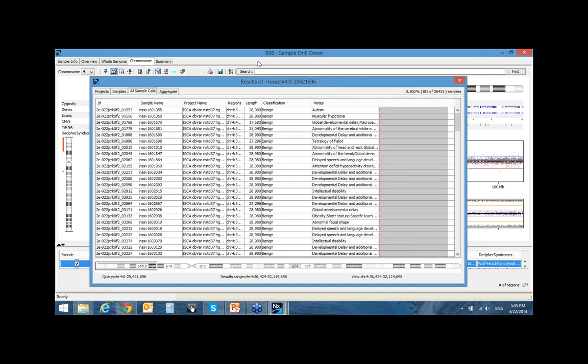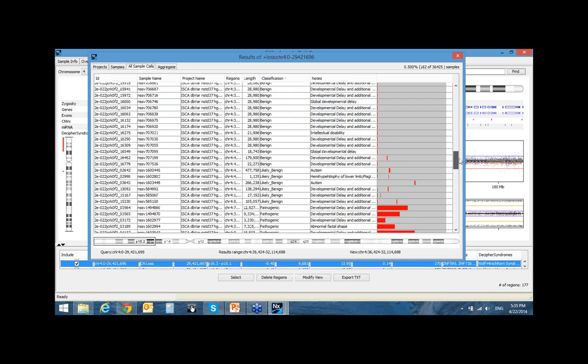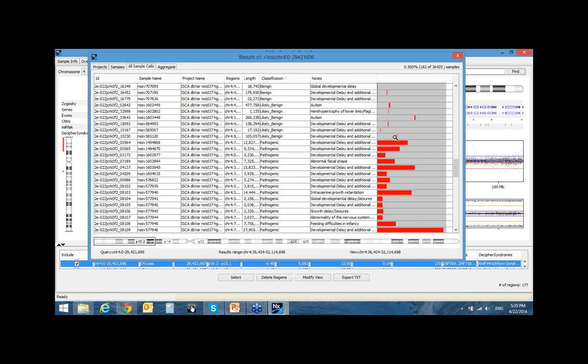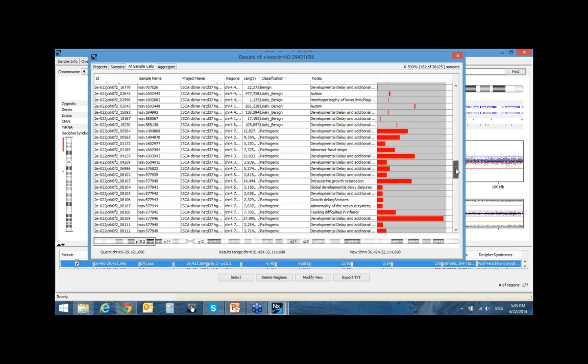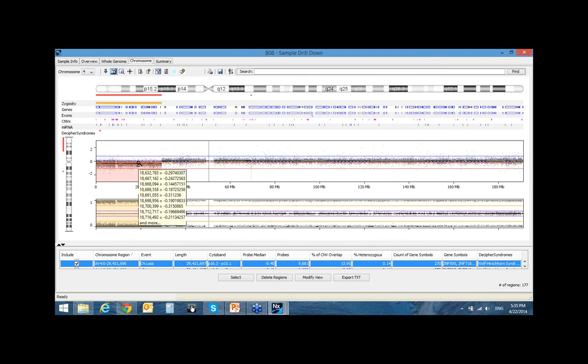So if you scroll down, you start to see more events, like those events are all pathogenic. So the big events overlap more with my cases. In here, a lot of them is actually related to that Wolf-Hirschhorn disease. So it gives you the description of what's going on with this. So this is the easy way for people to query against public database from your case.